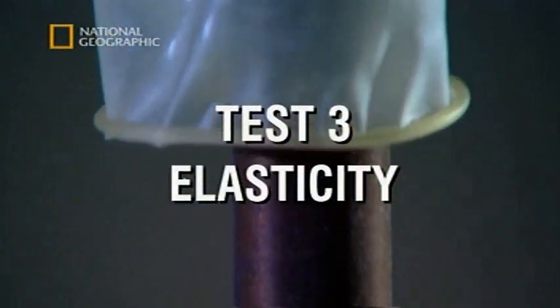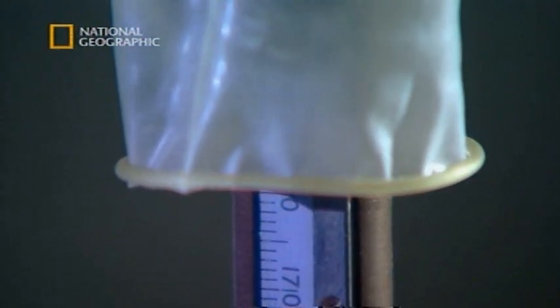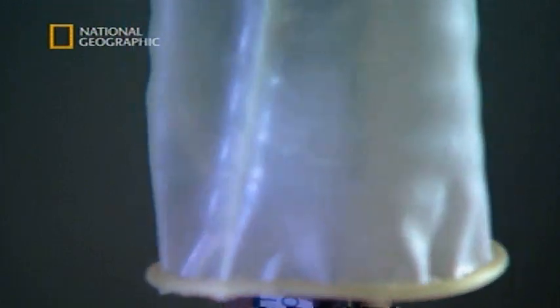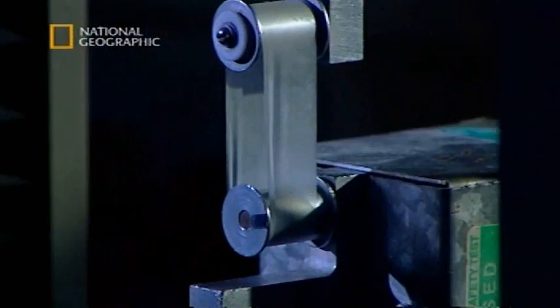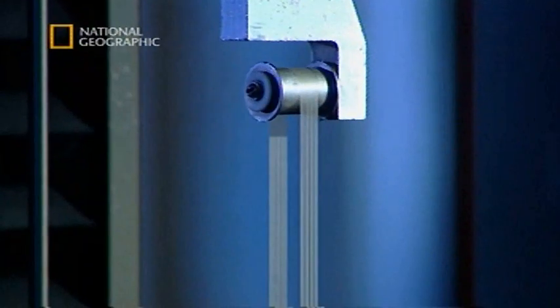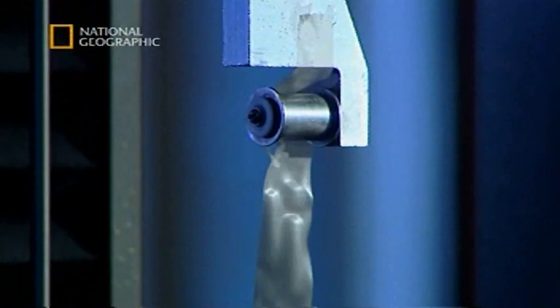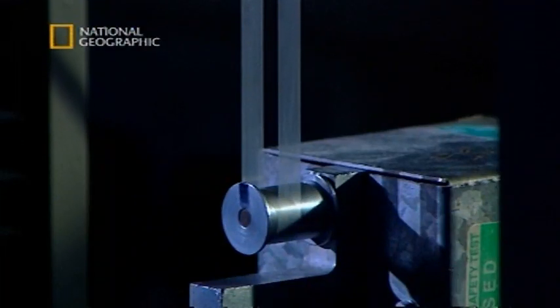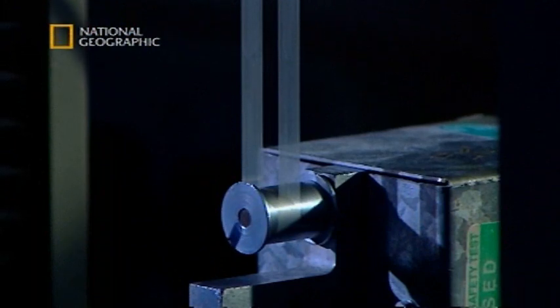Moving on to a test for elasticity. Condoms must be at least 16 centimeters long to pass the BSI test, and some have to prove they can stretch as well. A bit of rubber is cut from the condom and pulled to its limits. This one can take well over 100 newtons of force, which means it's passed.